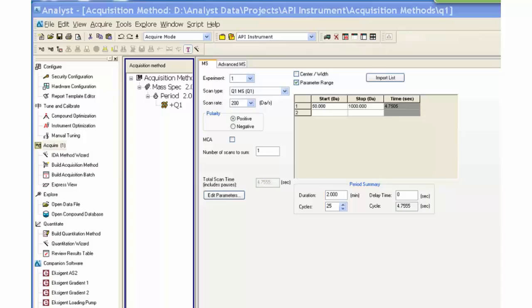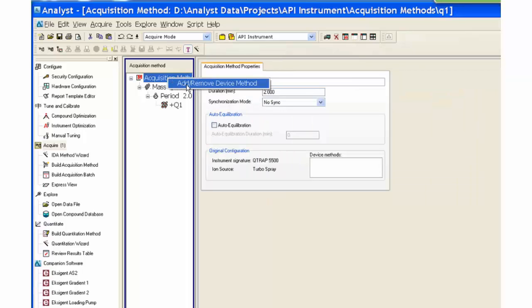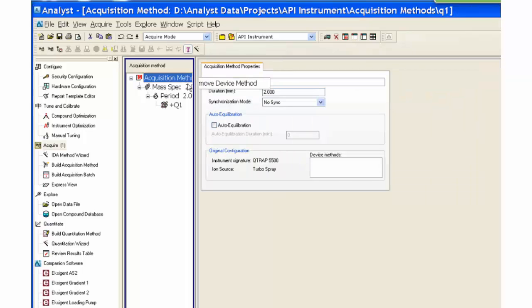Right click on the lower acquisition method wording, then click on the add/remove device method. Check the box of the device you want to add and then press OK.